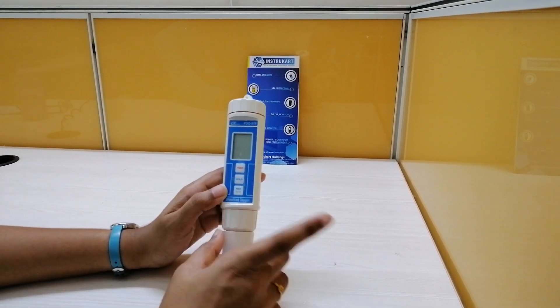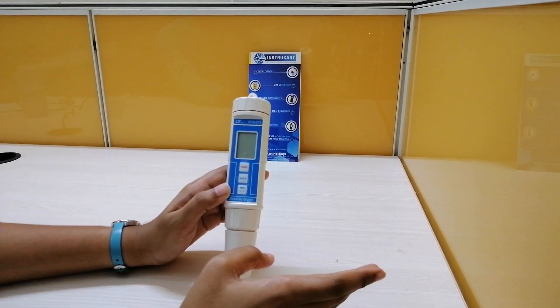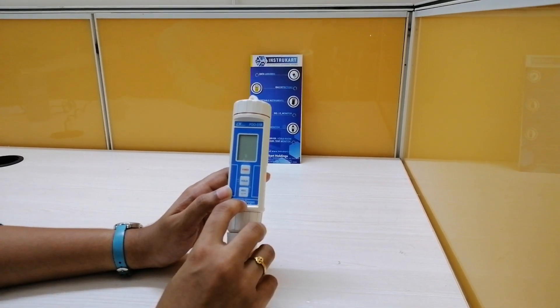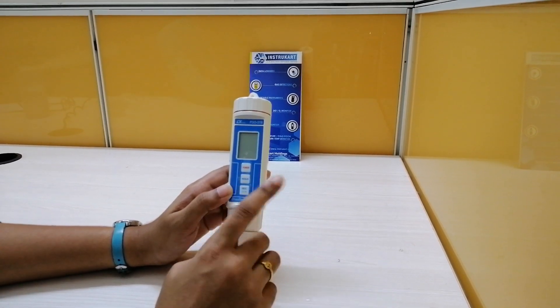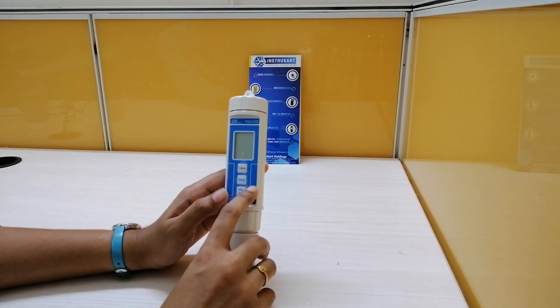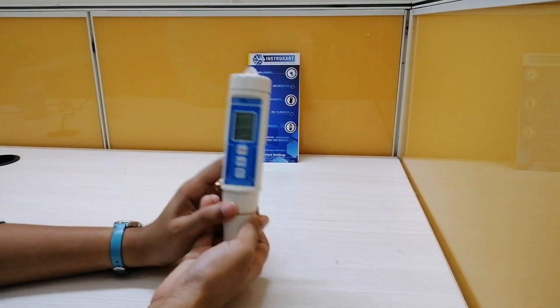The operating temperature and humidity will be 0 to 50 degrees centigrade with less than 80% RH humidity. Coming to the power supply, we use 4 pieces of AAA batteries for this particular instrument, and the weight is around 150 grams.